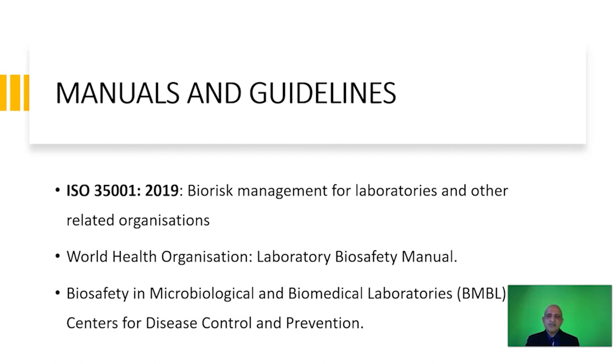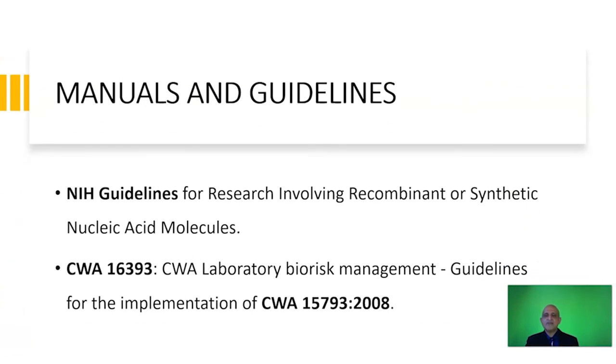Then we have the World Health Organization Laboratory Biosafety Manual. This is a very comprehensive document which we use as a reference for almost all of our procedures. We also have the Biosafety in Microbiological and Biomedical Laboratories, BMBL, Center for Disease Control and Prevention Reference Manual. Then we have the NIH guidelines for research involving recombinant or synthetic nucleic acid molecules. The CWA 16393 is a CWA laboratory biorisk management guideline for the implementation of CWA 15793:2008. I will be discussing these manuals in detail, and I will provide you with the links to all of these reference documents in the lecture notes.